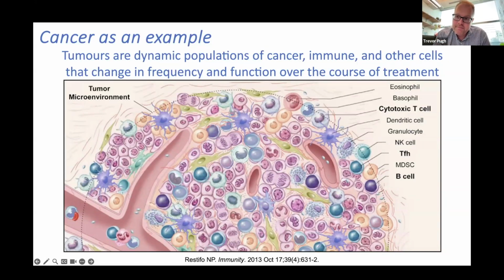Have you tested in the core system in Toronto the difference between Parse and the current 10x Genomics kits? We have not done a formal head-to-head because those users have been very different. With Parse, we haven't done total RNA sequencing. It's usually people who have panels where they know what transcripts they're interested in, whereas the 10x users are more in the discovery business. They want to sequence all the RNA and look at all the populations. So I don't see them really as direct competitors. I think the applications are different. Okay, thank you very much.